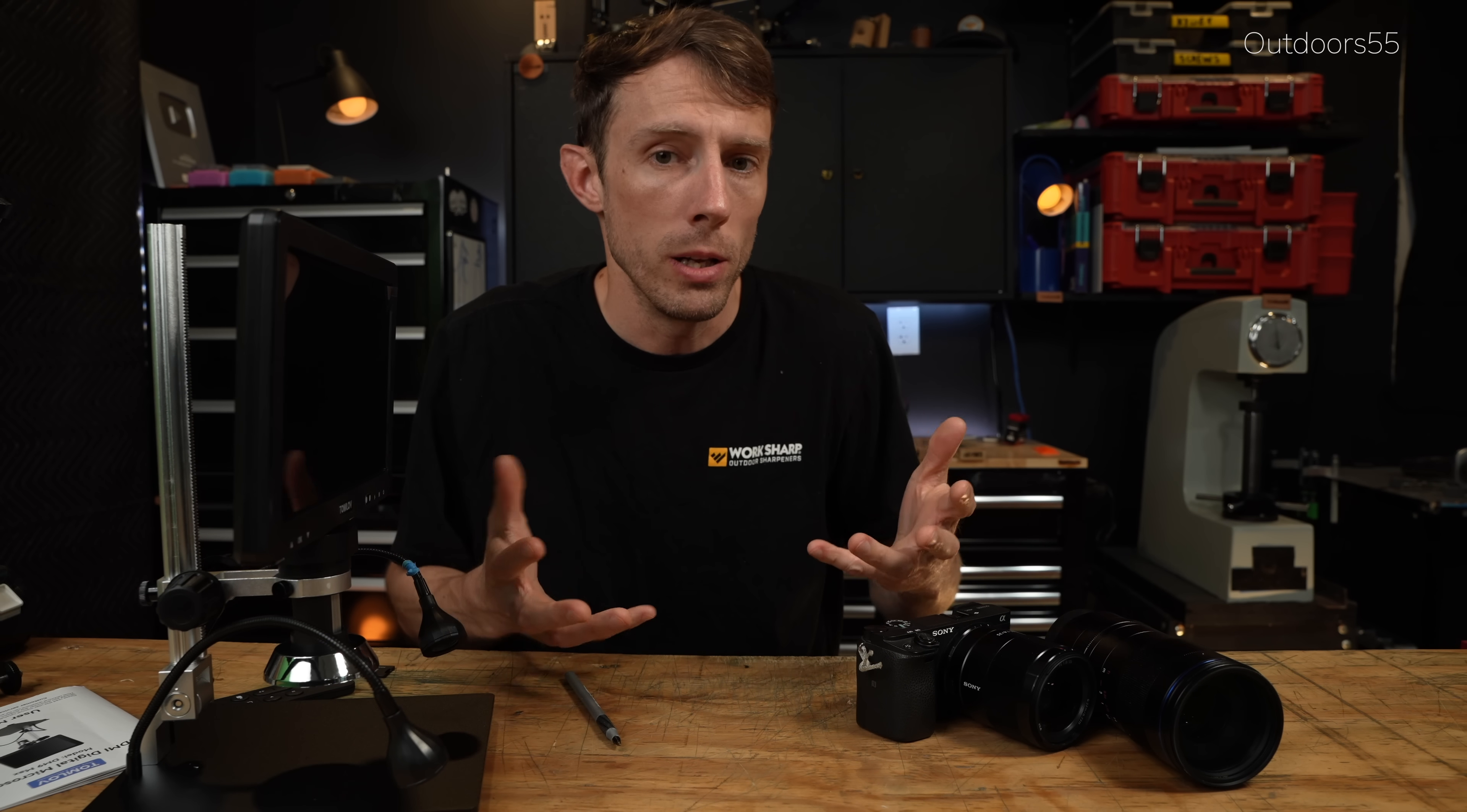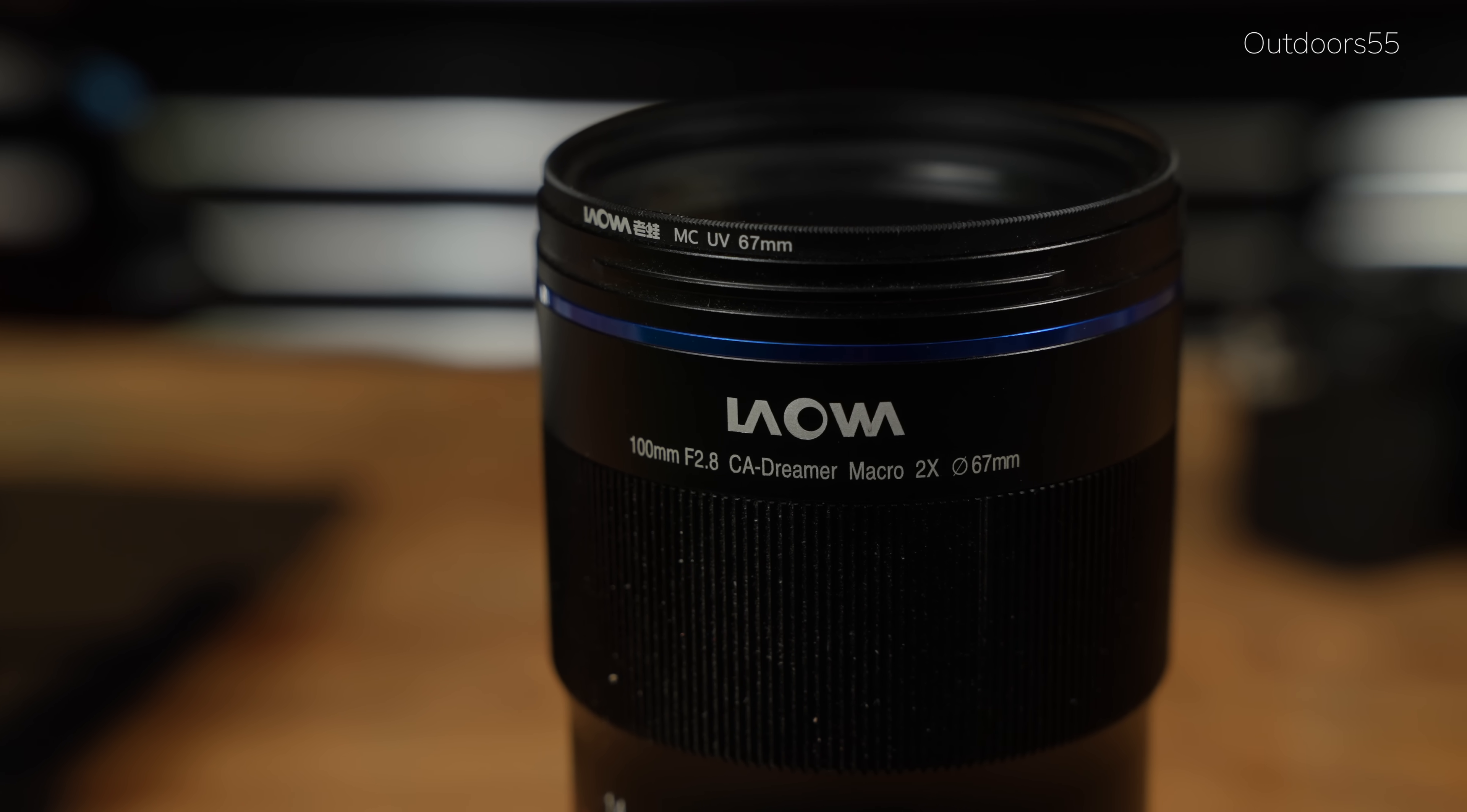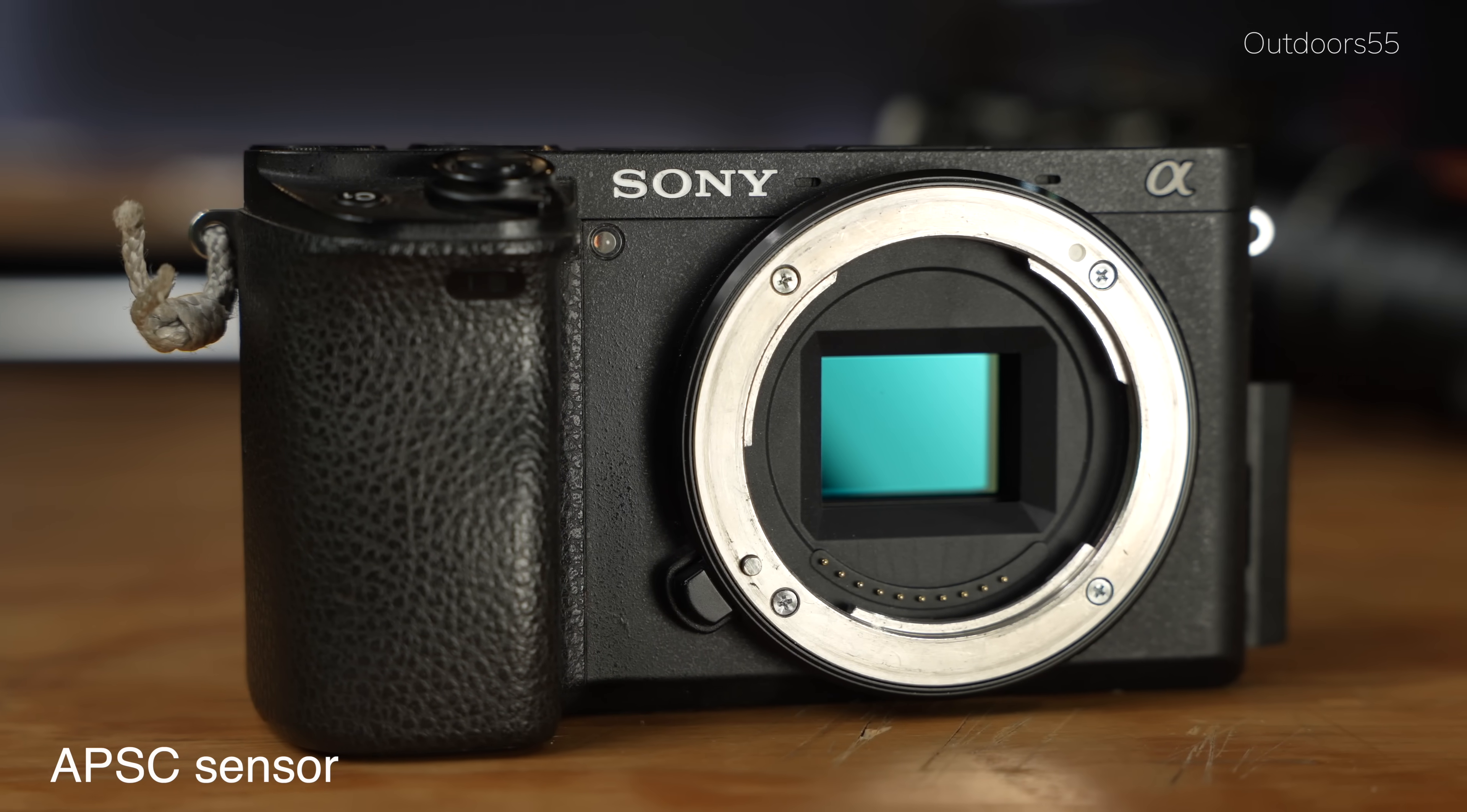Why does a 3.5X simple macro lens get closer than a 1500X microscope? That's because the X factor, as we're going to call it, or the magnification ratio on these type of microscopes don't actually mean anything. Now to give you an idea as to why this is the case with these type of digital microscopes, let me first explain the X factor for camera lenses.